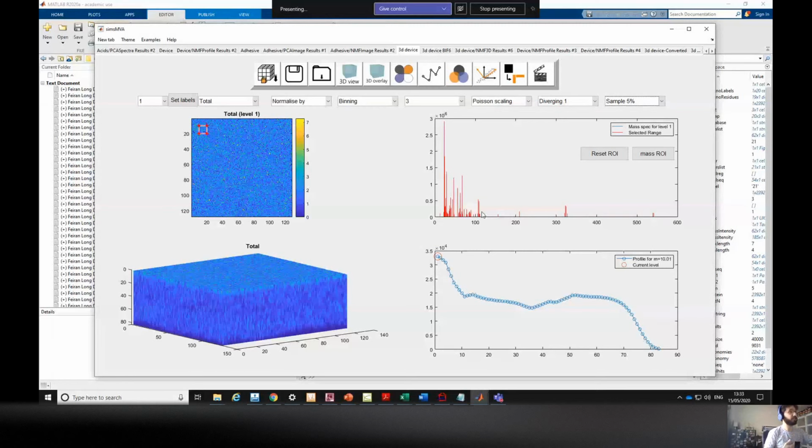Just remember, I forgot to show the results with the 10% in the imaging. We can go back there later. Sorry, I forgot to show. But let's continue here first, otherwise we just lose track.